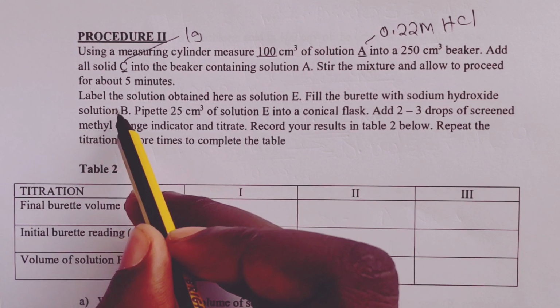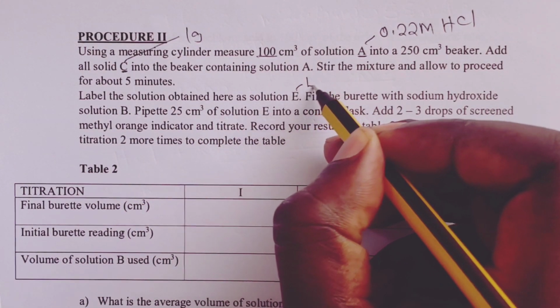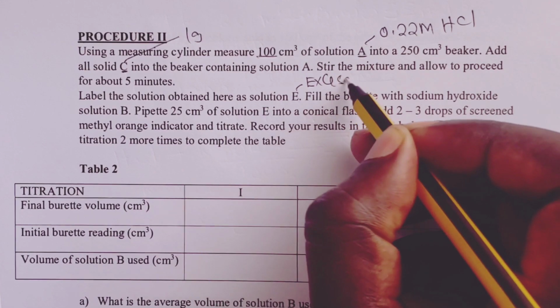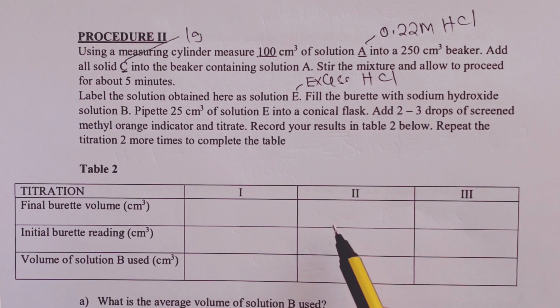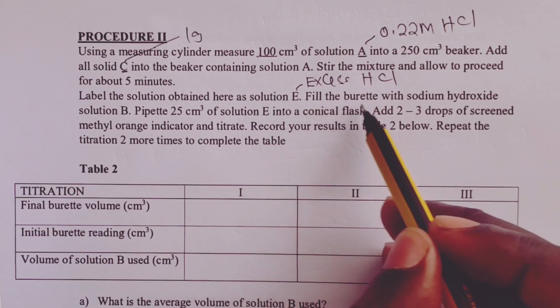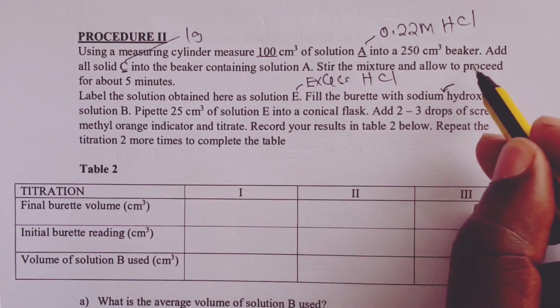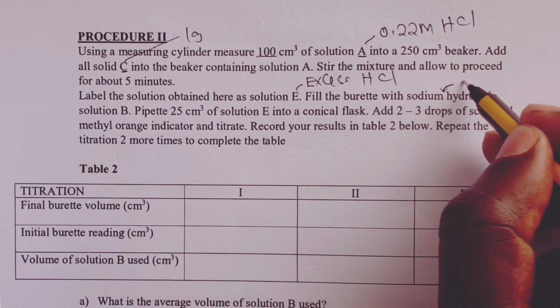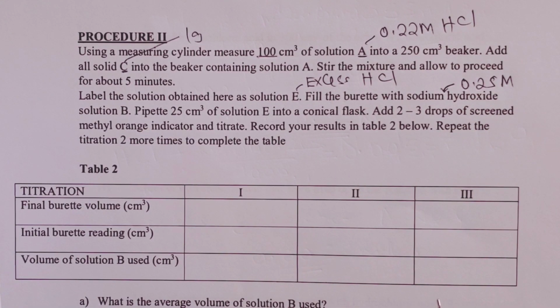So we are told to label the solution obtained as solution E. This is simply excess hydrochloric acid that will not have reacted with our carbonate. We are told to continue to fill a burette with our sodium hydroxide solution B, which was a 0.25 molar solution from our procedure 1.